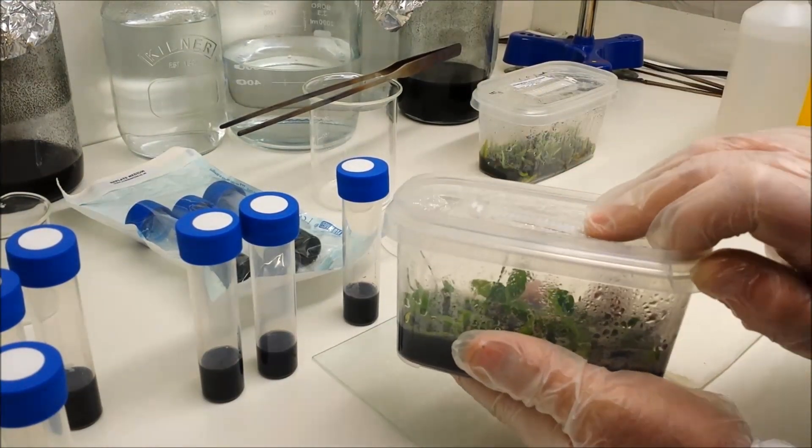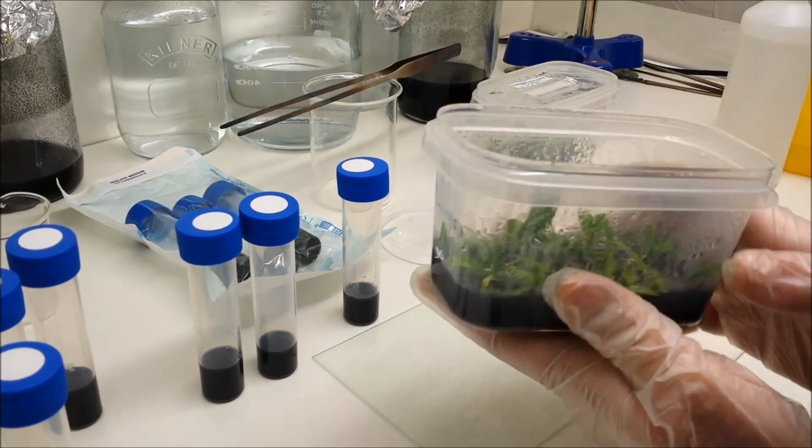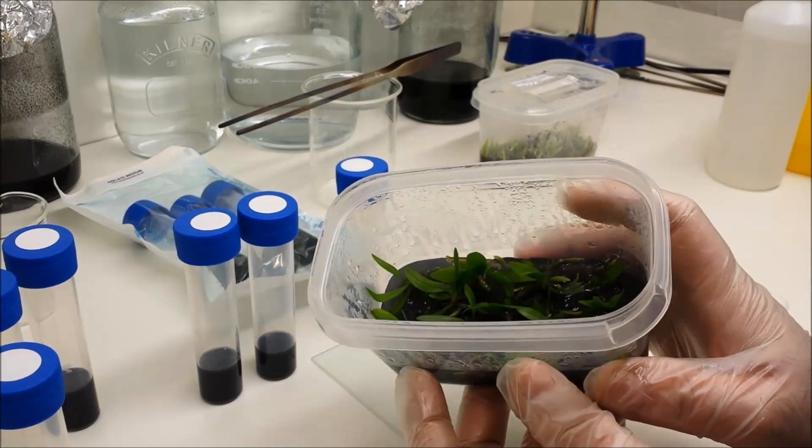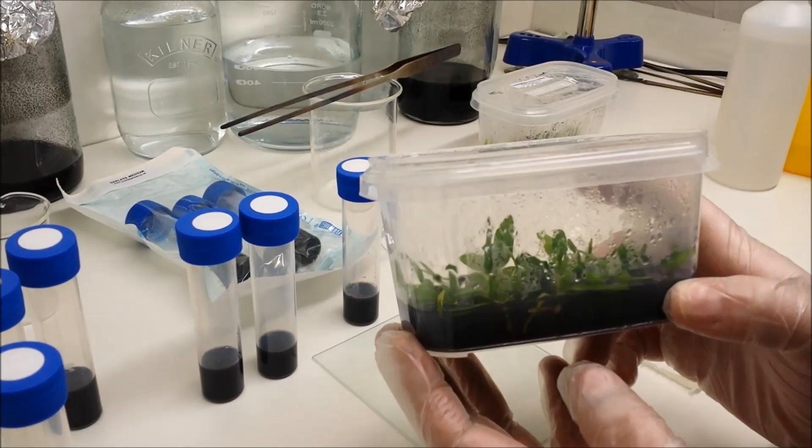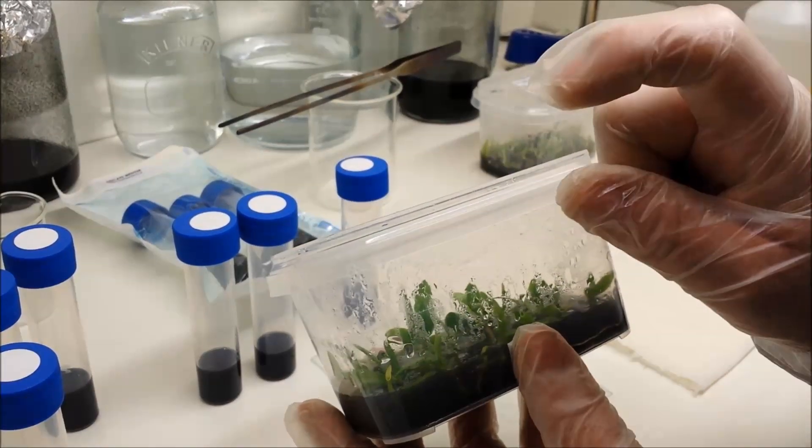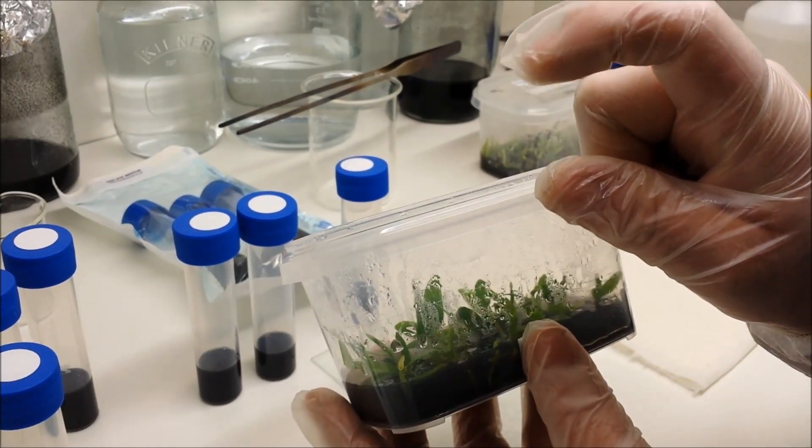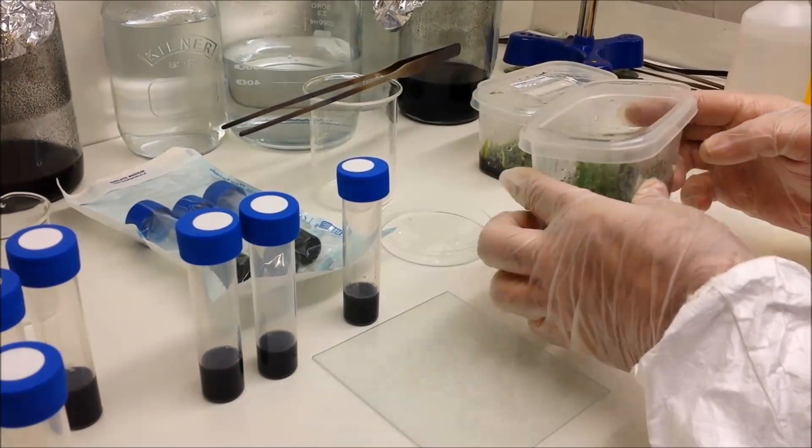The first one we're going to do is Aerangis decaryana, which is a lovely fragrant flower from Madagascar. These plants are around about an inch high—you'll probably see better from the side. So you want to wait until they're around about that high, about an inch, before you want to consider replating.